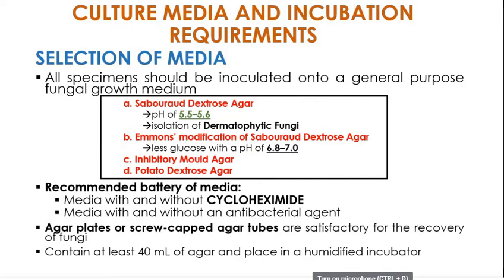Junavie? Hello, ma'am. Ano yun, ml ng ating media noon sa bakte? Maalala nyo pa? 25, ma'am. Yeah, 20 to 25 ml. Sa fungi, sa ating mycology, dapat yan at least 40 ml. Bakit 40 ml?